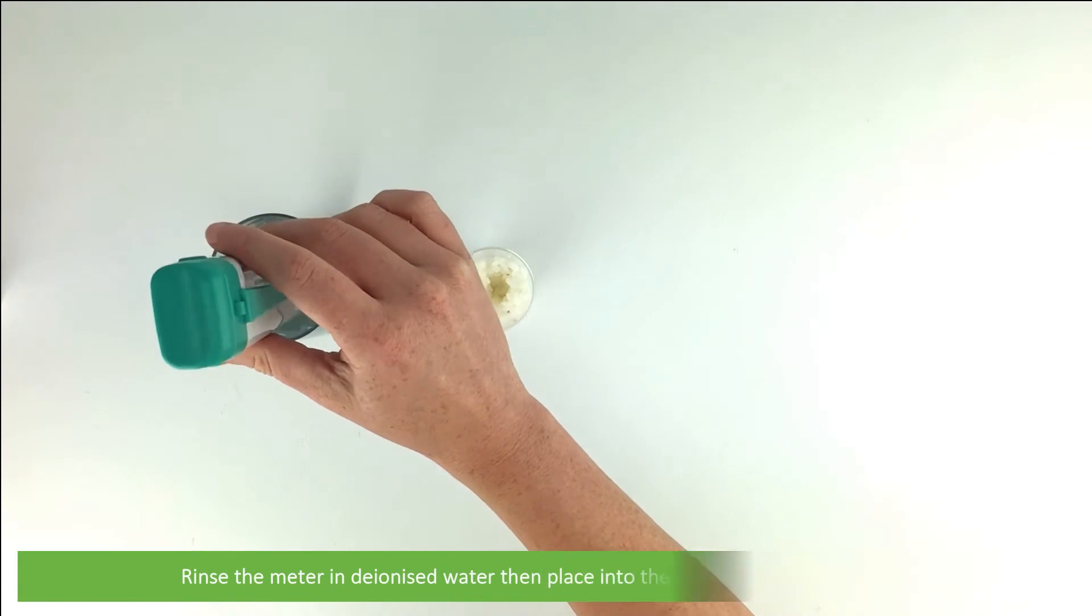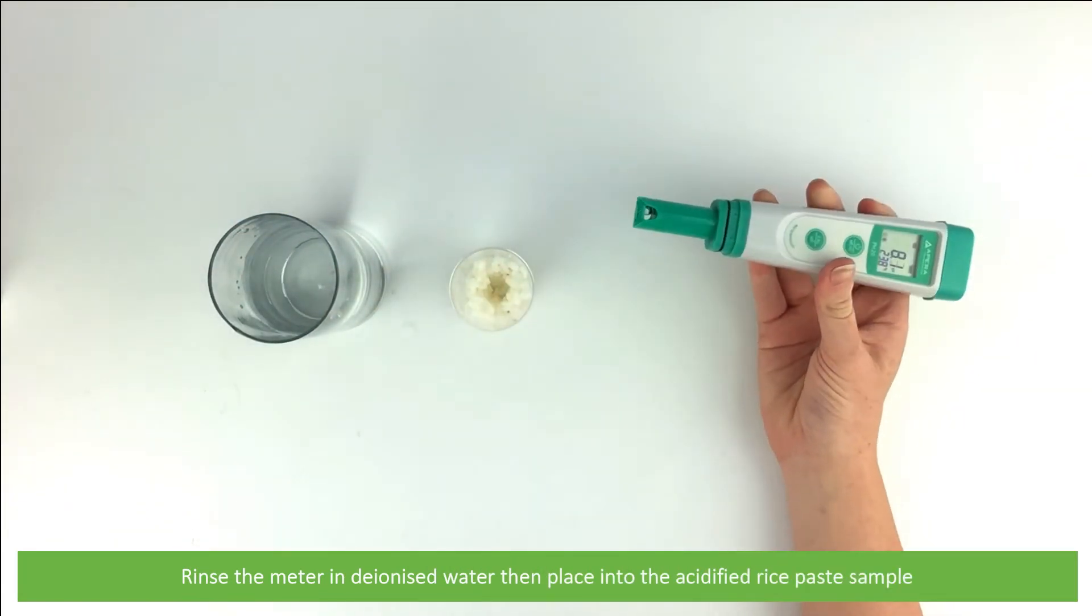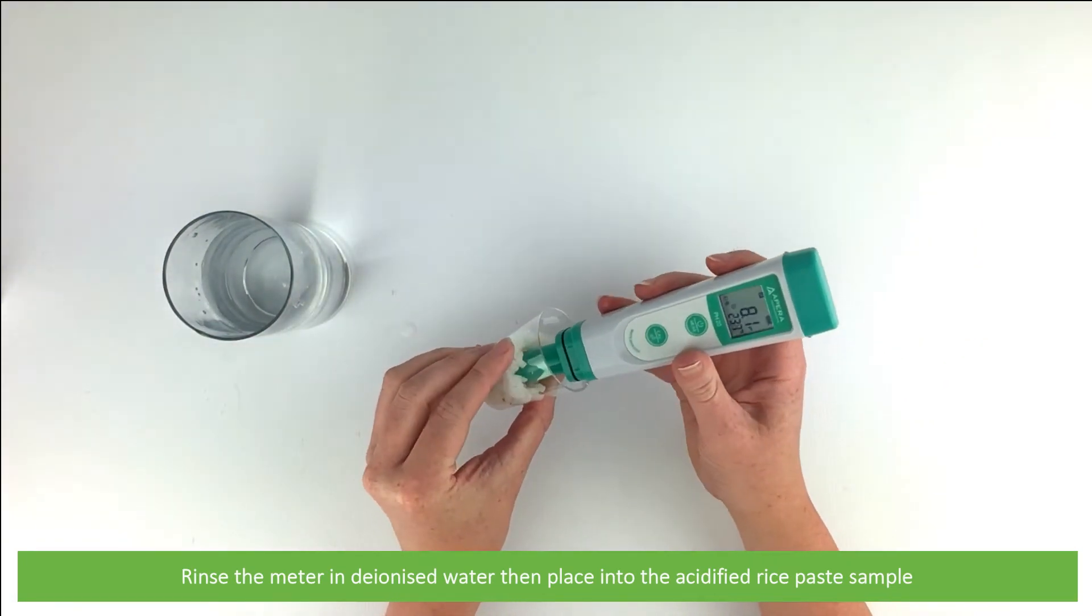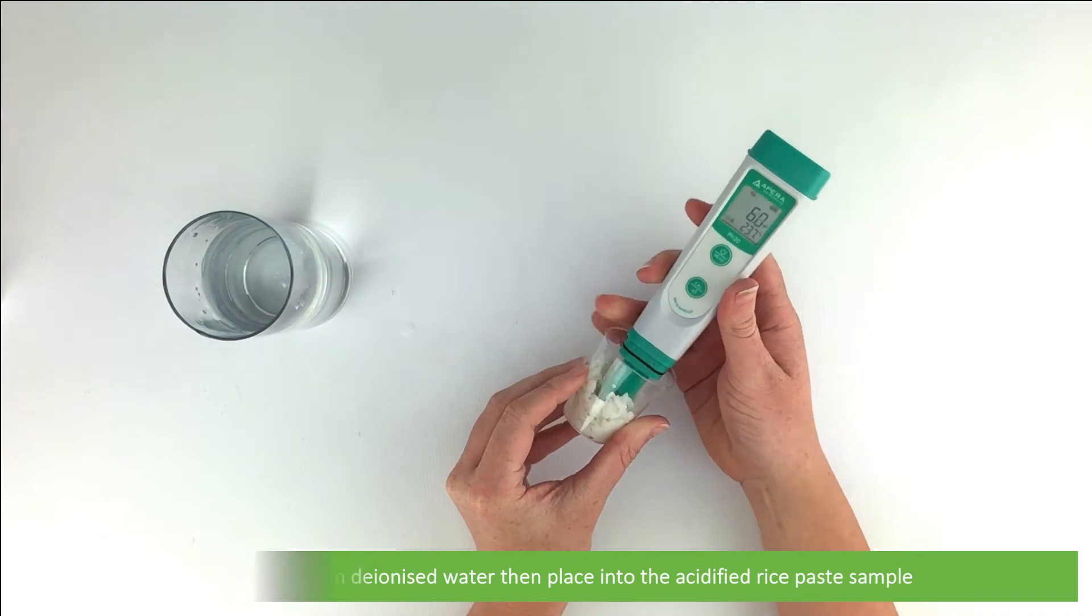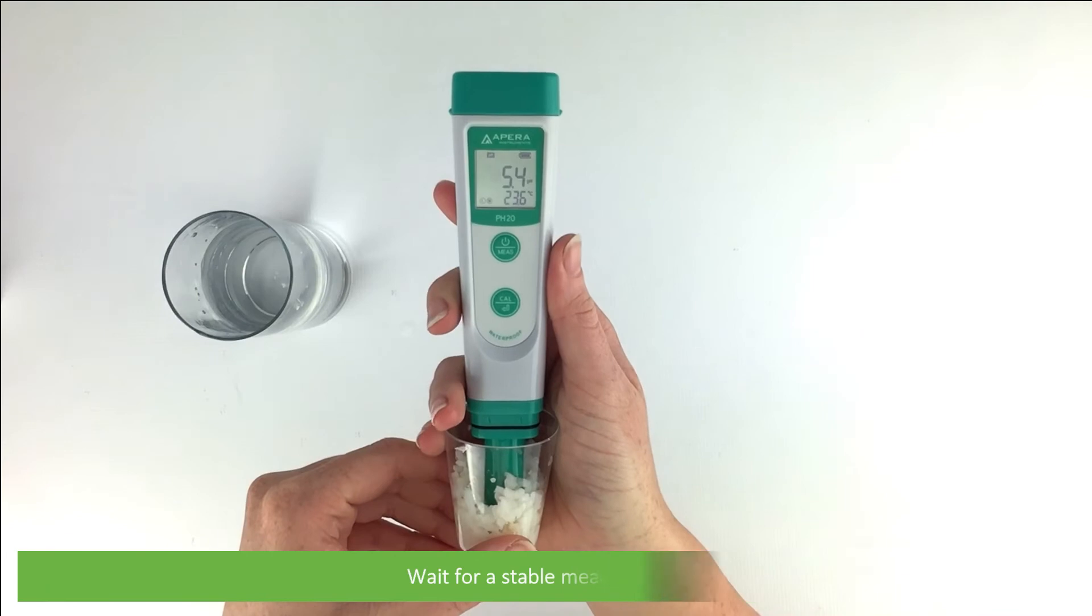Rinse the electrode in deionized water, then place into the acidified rice paste sample. Wait for a stable measurement.